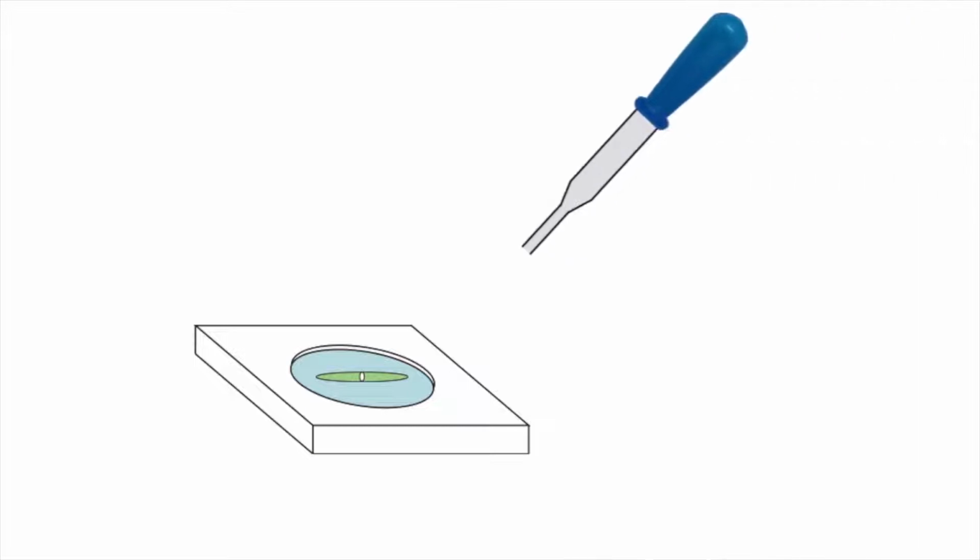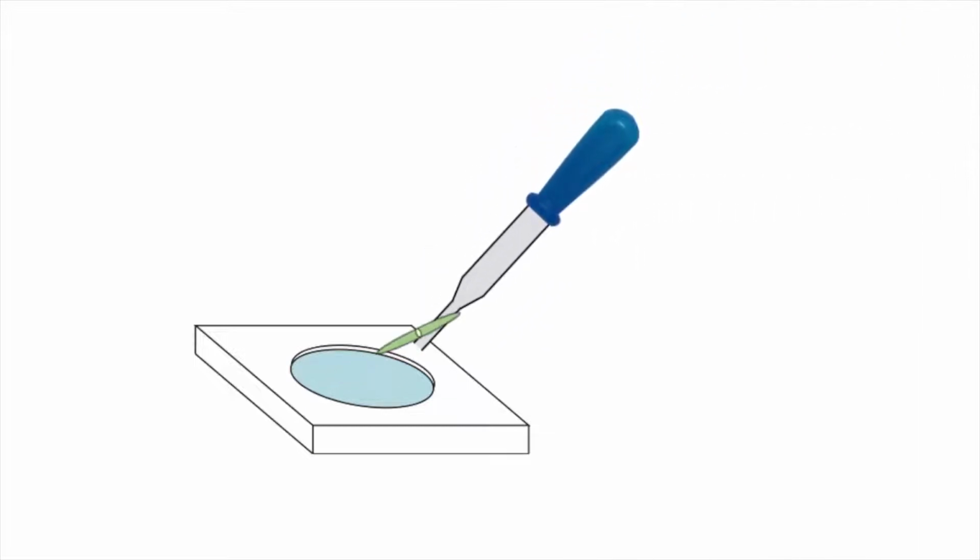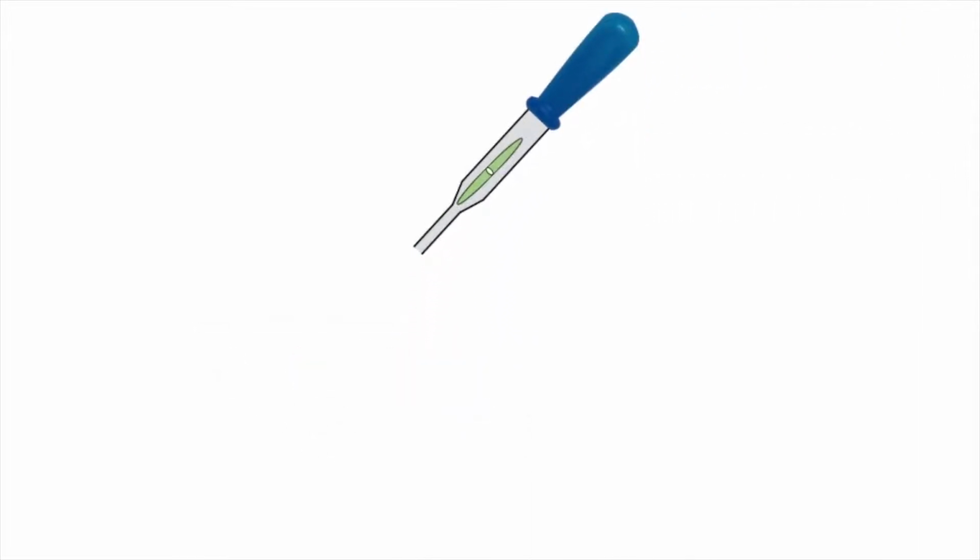Sterilization is possible if it is conducted in a careful manner. Finally, the isolated cell is transferred to a test tube and the strain is established through cultivation.